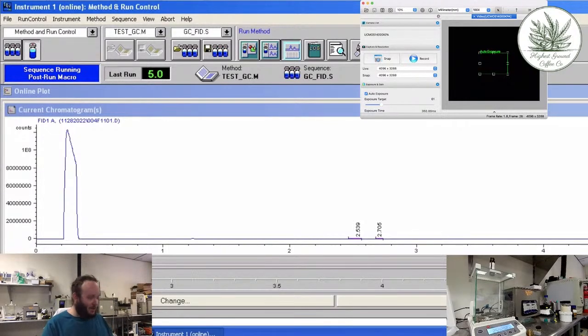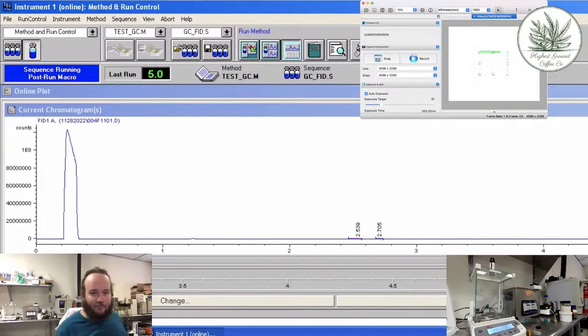All right, so that run just finished. I'm gonna see if this sequence is still running before I go and do anything else. All right, so let's go to here. I'm gonna do a 10.